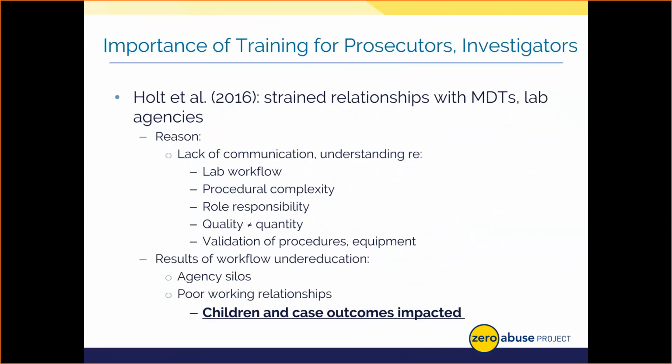Let's go ahead and start by talking about the importance of this training for prosecutors and investigators. There's been research performed that's tried to figure out why labs are sometimes in conflict with investigators and multidisciplinary team, or MDT, members that are submitting evidence to forensic laboratories. What we found from those studies is that oftentimes labs are understaffed, under-resourced, and overworked, leading to potential backlog.